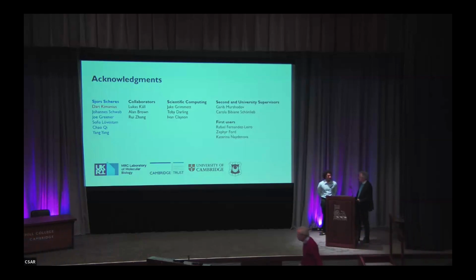Can I ask, does AlphaFold have any bearing on this? Yes, so AlphaFold helps you predict protein structures from the sequence. It performs less well when you have multiple proteins, in massive multimeric complexes like the phycobilisome I showed, and also if you don't have sequences available, which is a lot of the problem we were trying to solve. Then you cannot use AlphaFold. So AlphaFold definitely comes in when your resolution is lower, but you know what's in the multimeric complex. Interesting.